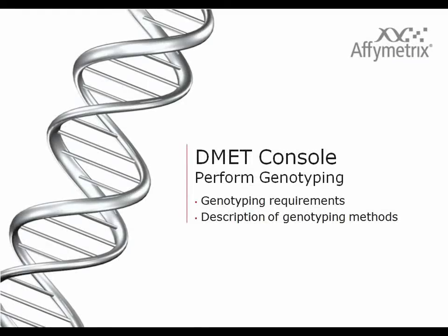This section on DMET console software is about performing genotyping with a focus on genotyping requirements and a description of genotyping methods.